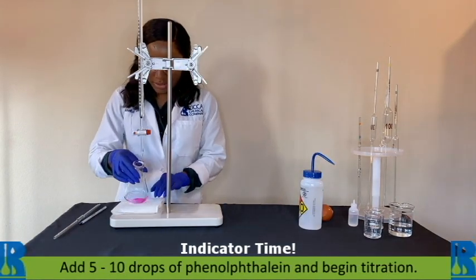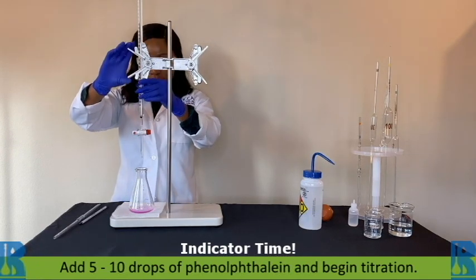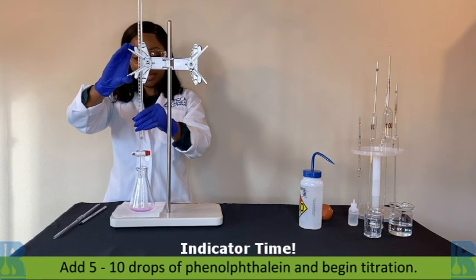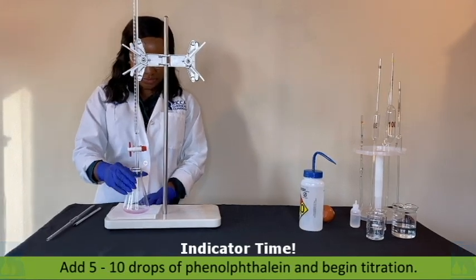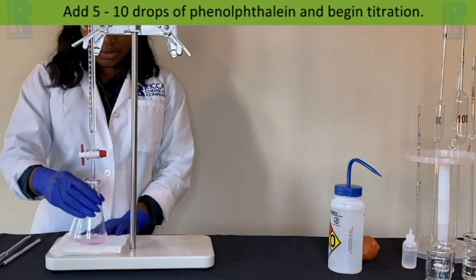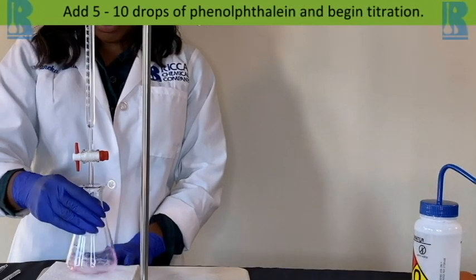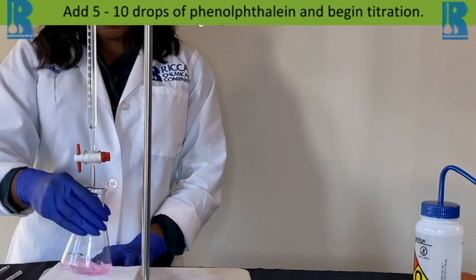Now let's begin our titration. Whenever you know where your desired endpoint is, you can drain pretty confidently until you get close enough to where you need to slow down. Technique is always important, so go ahead and give it a swirl — that way you'll know that what you're seeing is well mixed and that it's correct.